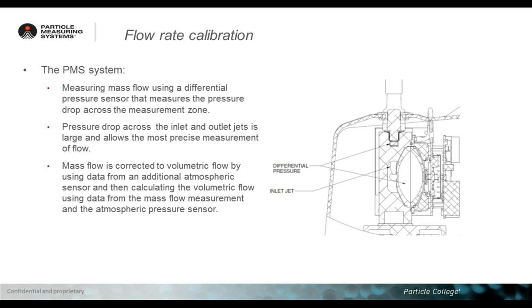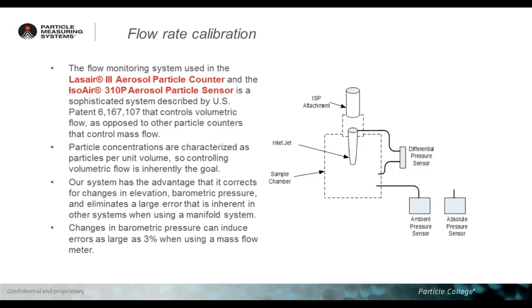So to be able to accurately detect your volume, the instrument should employ additional sensors inside, for example, an atmospheric pressure sensor and a temperature sensor, which in real time will be able to fine adjust the sampling flow rate speed, and so the speed of your blower.